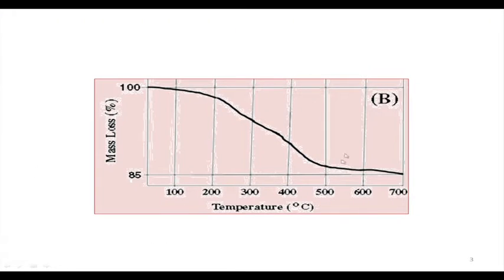And nowadays the automatic instruments can record this particular type of plot, where, as I told you in one of our previous classes, whatever amount of sample, it can be 15 milligram or 10 milligram of calcium oxalate, we go for the heating process depending upon the crucible you have. The small crucible holding 15 or 10 milligram of sample is heated within the furnace, but when we plot, the plot is the corresponding mass loss in percentage.